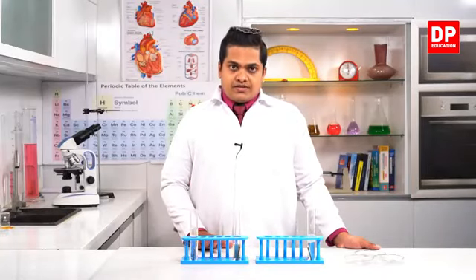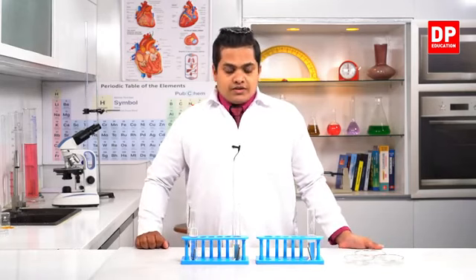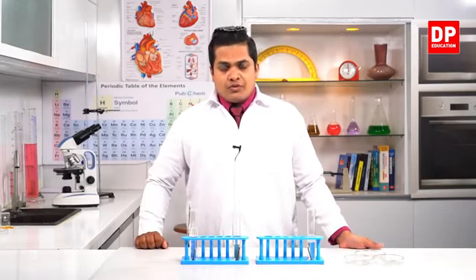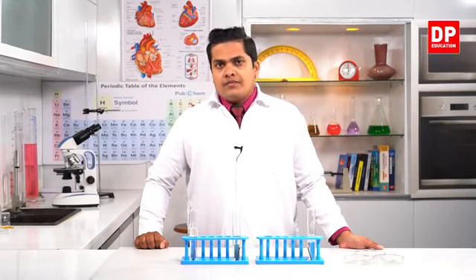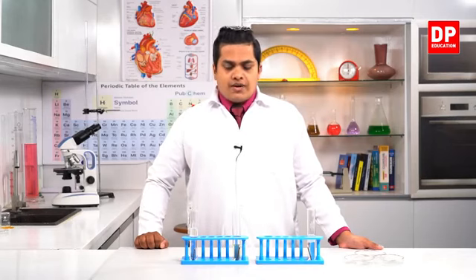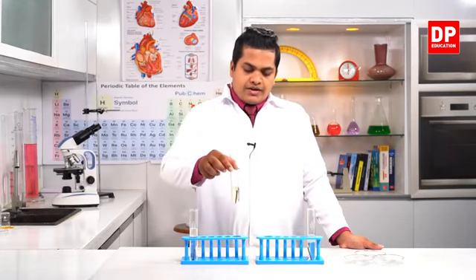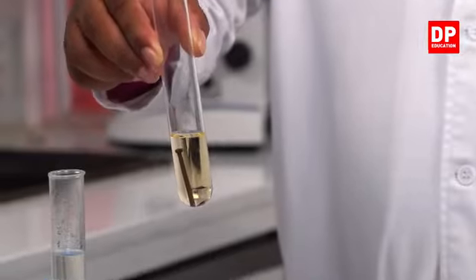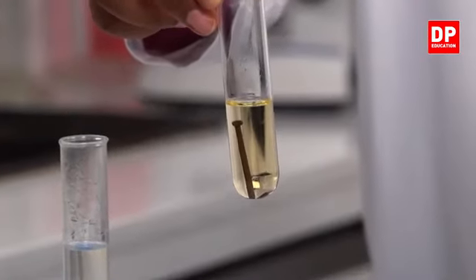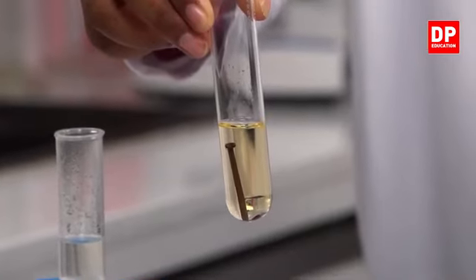Now, I have kept this system for about several days. So now I am about to see what changes occurred in each of the iron nails. So first of all, I am going to take the boiling tube that contains normal water. If you check this setup, you can see clearly the color of water has already changed.